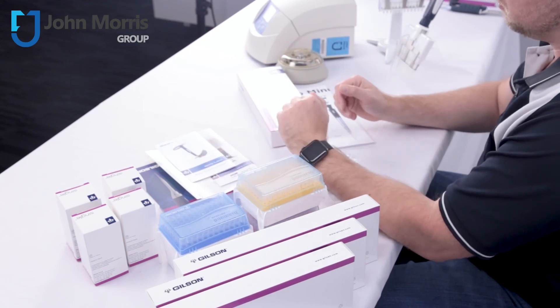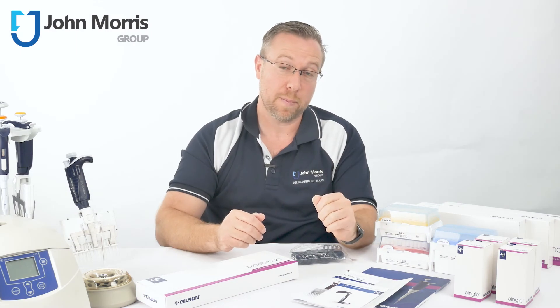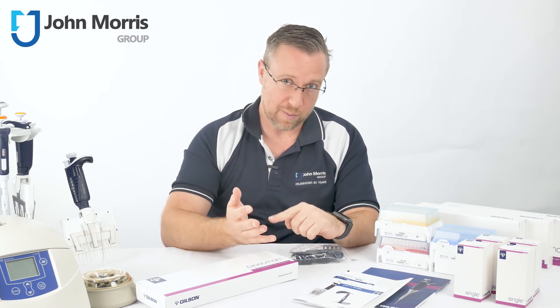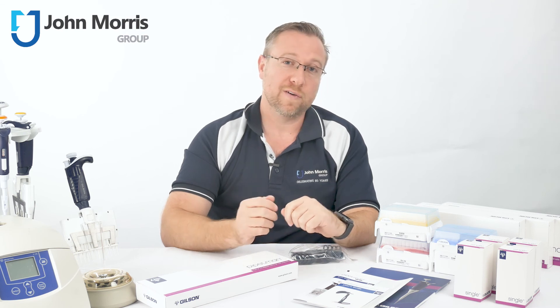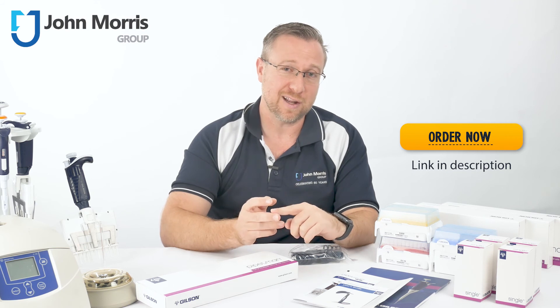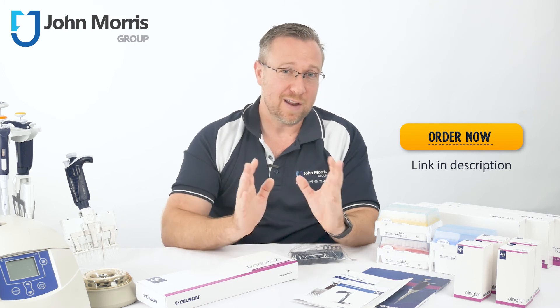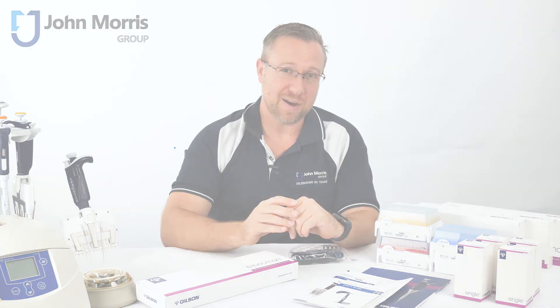All of the guides you might require for quick inspections or detailed help on how to use or calibrate the pipette yourself are included. And don't forget, John Morris is right there beside you with specialist trained staff. We have on-site services for calibration and verification, or we offer two levels of calibration and verification in-house: NATA and standard. Thanks so much for watching our first unboxing video — if you liked it, please leave comments below, and if you have any questions we look forward to hearing from you. Thank you and bye for now.